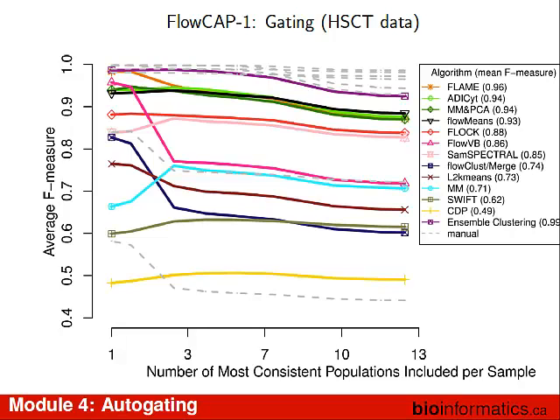You're getting a general overview of how to gate this population. Throw all the algorithms in, they're going to find lots of different stuff, pile them all up, and where they agree more tends to be closer to what the humans have. So that's kind of a win. So the short answer, in terms of what algorithm should I use, is you should use all of them. And through the power of computers, it's not that hard because it's just computer time. You just throw another algorithm into the tool, you gate it again, and you just get longer breaks. The computer's busy working, that's okay, and you can go do other stuff.